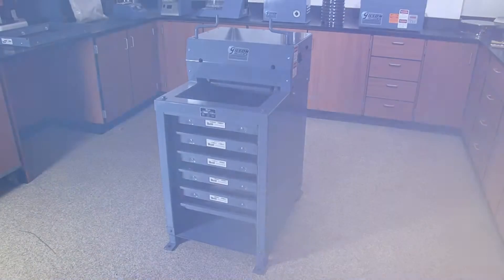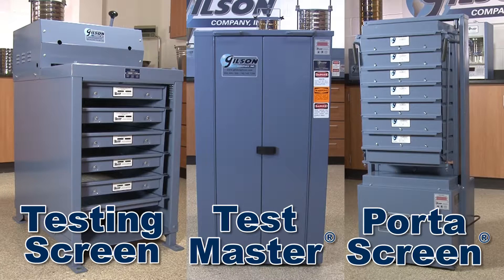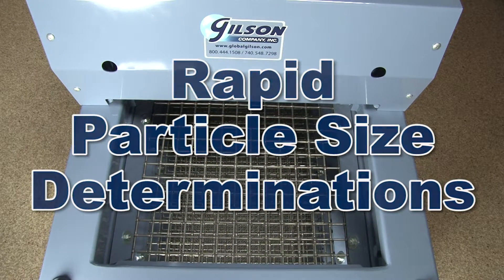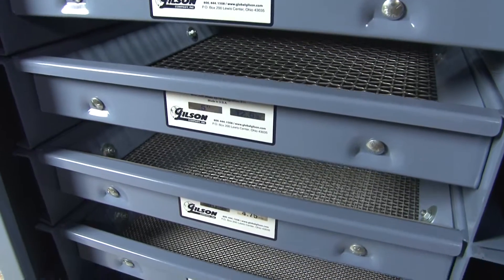Testing screens have been the gold standard for particle sizing of large samples for over 75 years. Gilson offers several models to choose from. The Gilson TS1, TS2, and TS3 testing screens are designed for busy high-production settings and will quickly process up to a cubic foot of material into six size fractions in as little as five minutes.